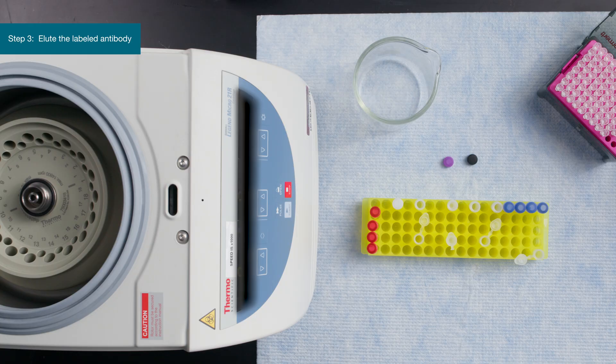If a poor yield is achieved, use the pH 2.0 elution buffer. By following the simple protocol we've demonstrated today, you can efficiently label antibodies for your multiplex or spatial biology experiments.